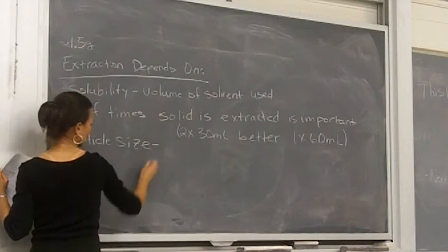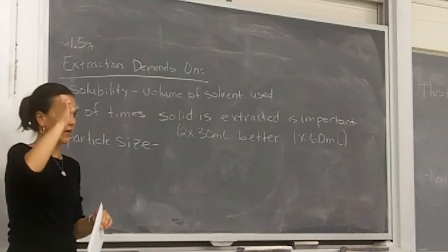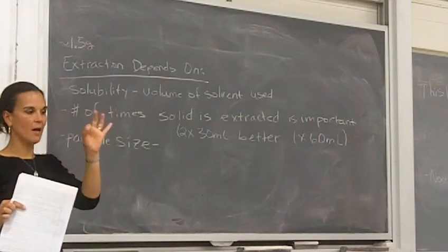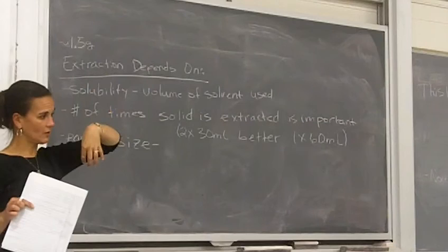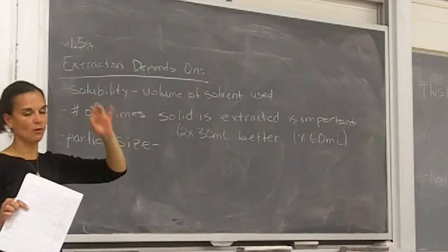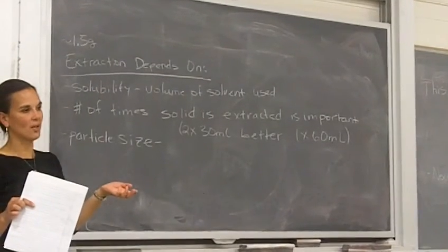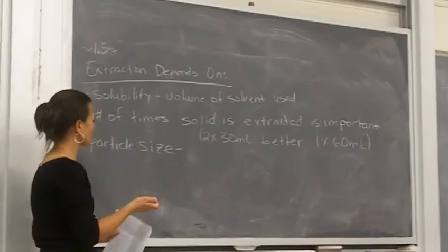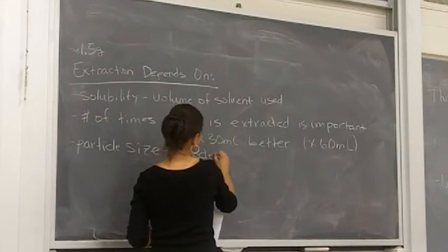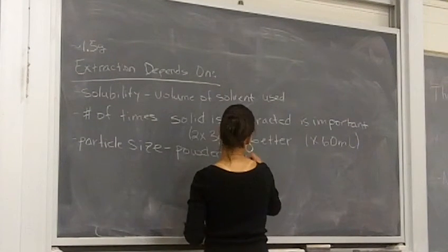So we're not using, like, nutmeg is actually a nut, kind of like an acorn nut. We're not going to take solid nutmeg nuts, take the solid, quarter size or so, and put it into the ether. That's not going to help us get much nutmeg out, right? So we're going to use powdered nutmeg, which is much better than just the solid or non-powdered nutmeg, okay?